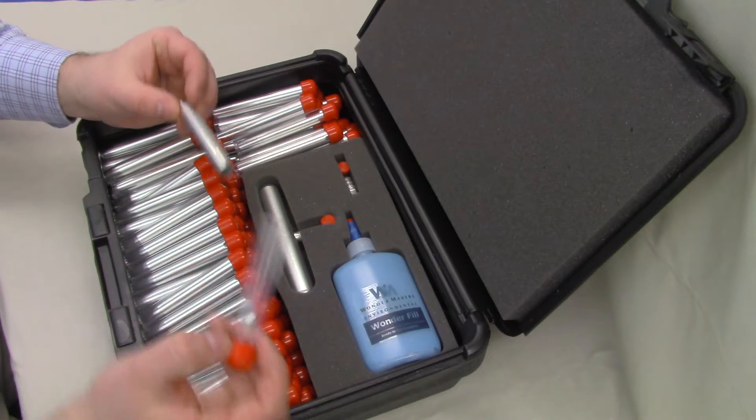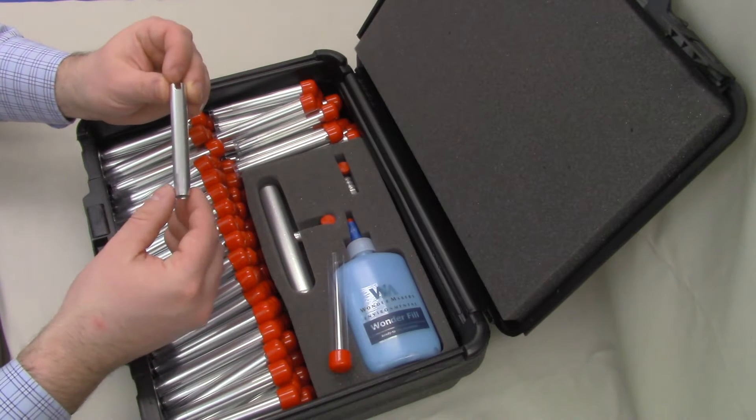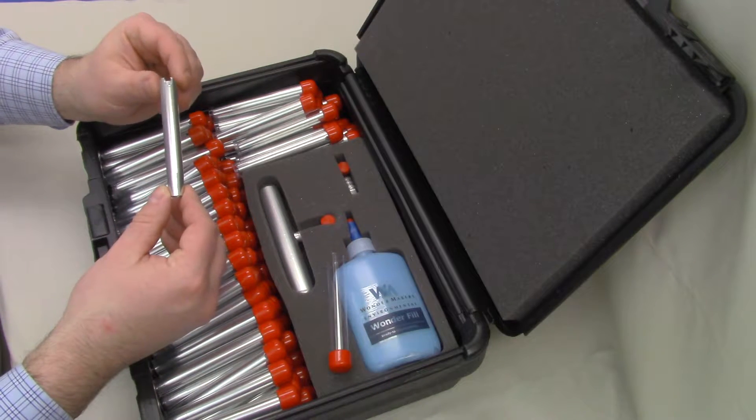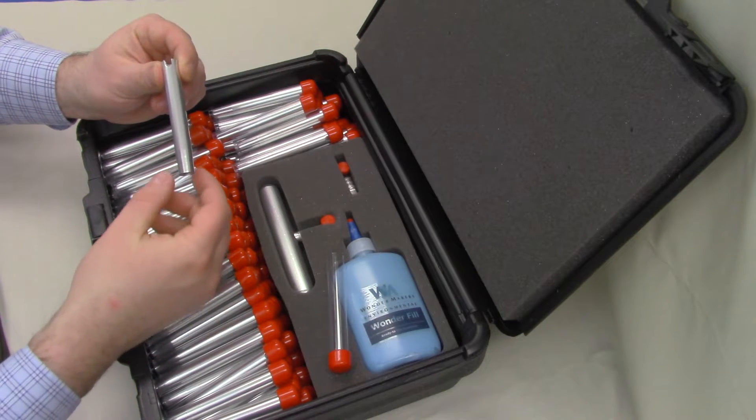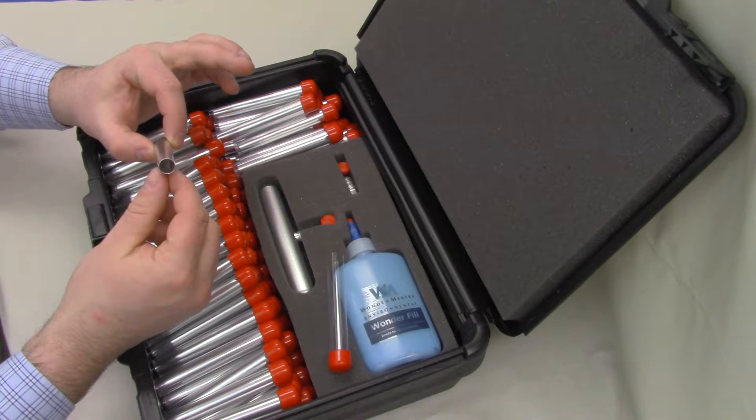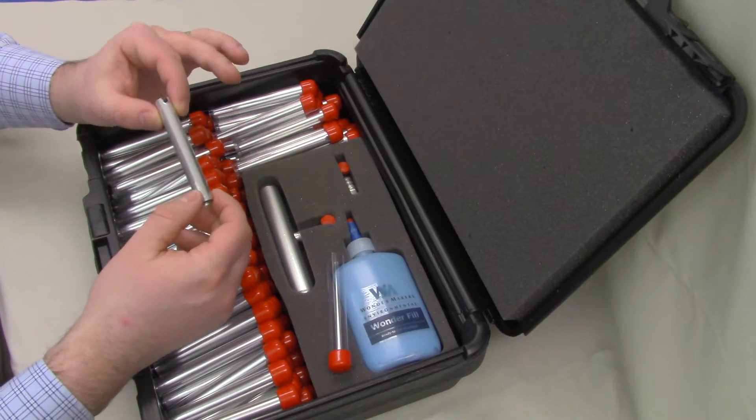We've got a notch at the top that's going to interact with our handle and power driver. When we get to that in a moment, it's tapered on this end to make it easier to cut. And then it's hollow all the way through for pushing that sample out once it gets to the lab.